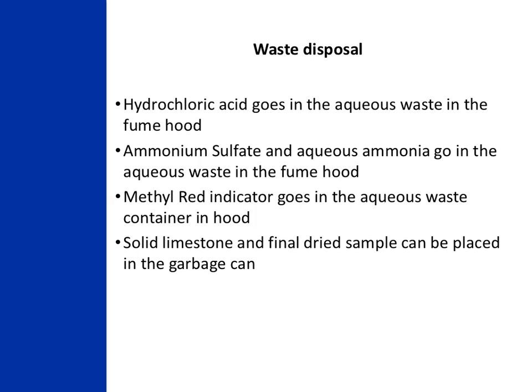For the general chemistry labs, we mostly use acids and bases in aqueous solutions, so we generally refer to the aqueous waste containers as simply the waste container. Other labs will have to separate out other types of waste into separate waste containers, so please pay attention to your instructors on how they want you to dispose of waste.